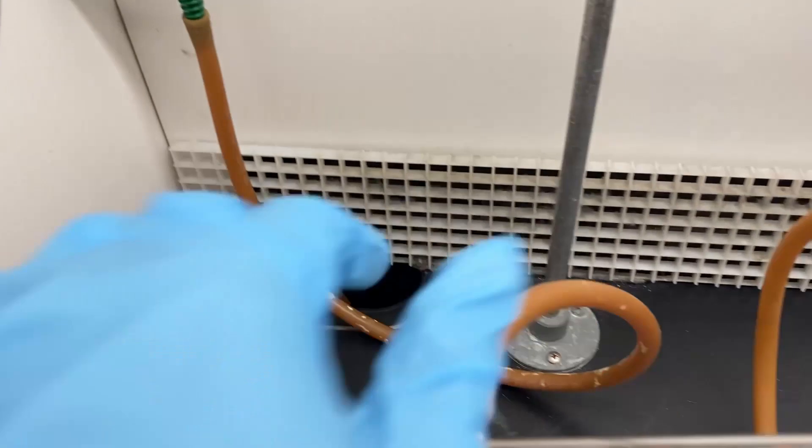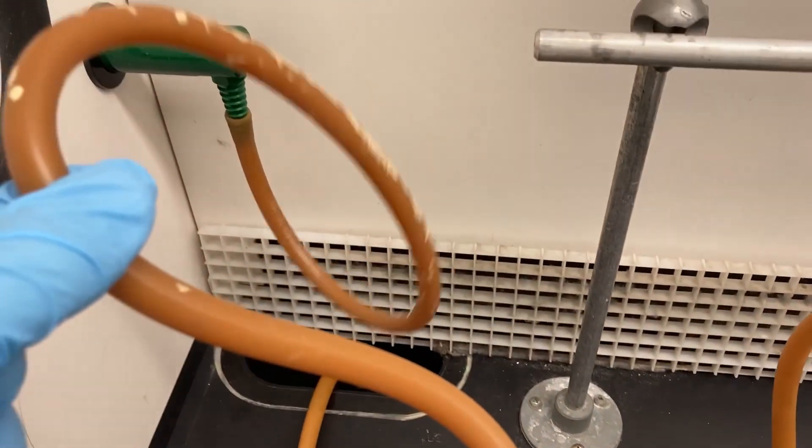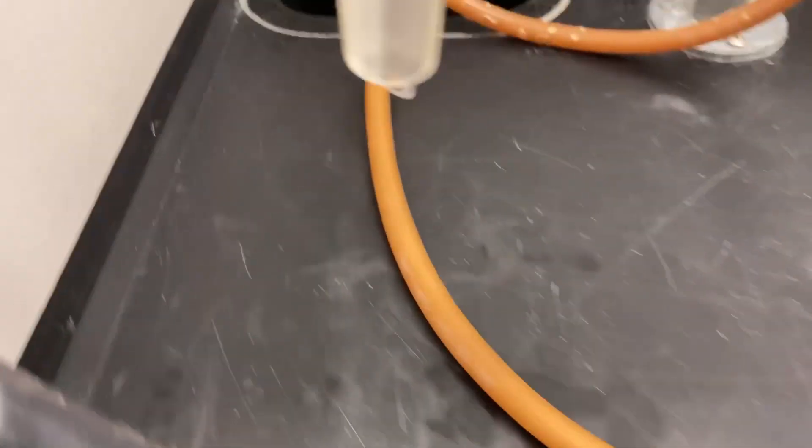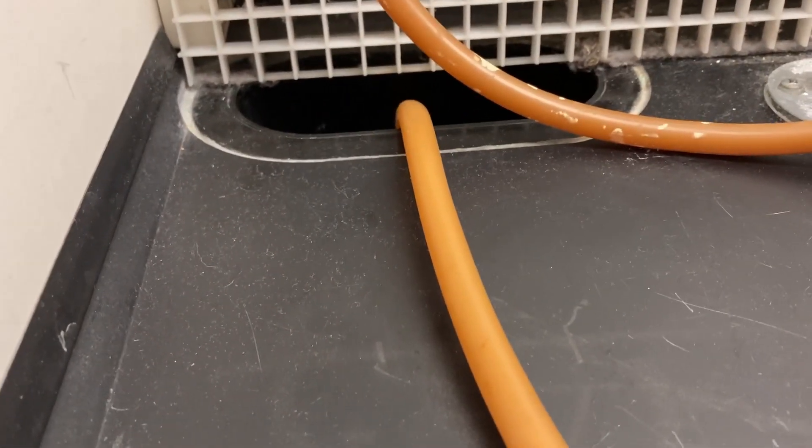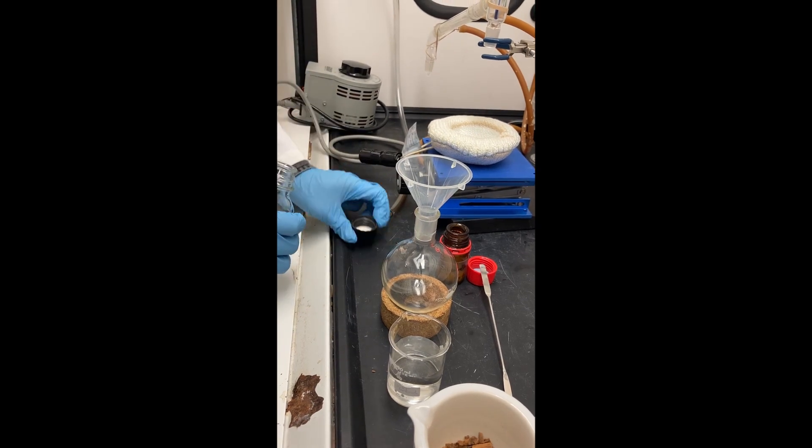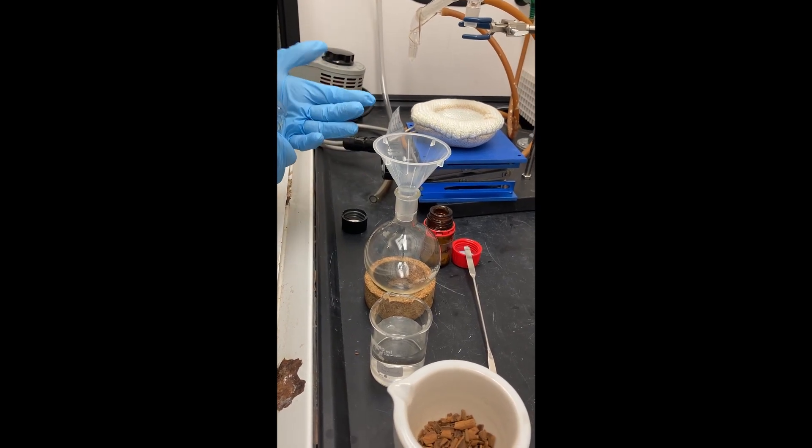Make sure your water hoses are attached correctly to your condenser. Load your round bottom flask, making sure not to get any solid in the grease of the joint as this can affect the seal.